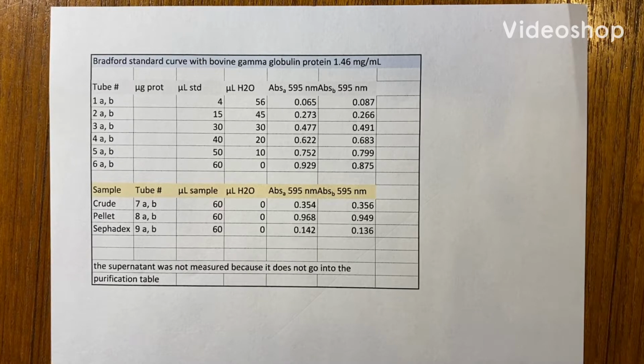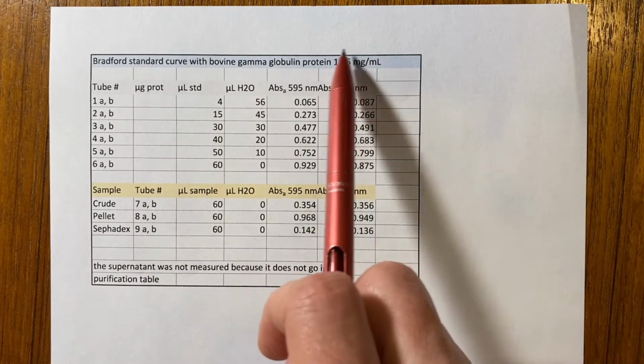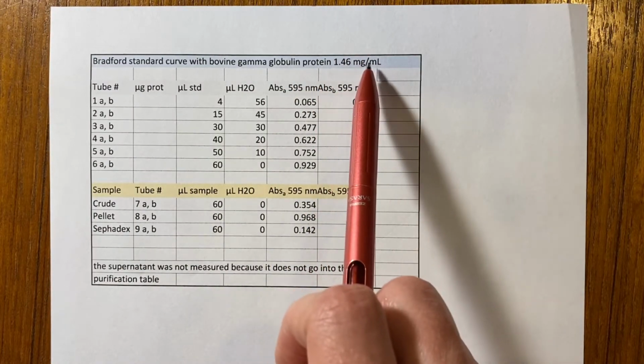Hi, this is probably my last video on how to analyze your laboratory data. So here we go. This is talking about the protein concentration measurements that were made to finish your protein purification table. So the first thing you have to do is plot a Bradford standard curve with the top data in this table. For the Bradford standard curve, we have a different standard protein with a different concentration, so you'll have to take that into account.